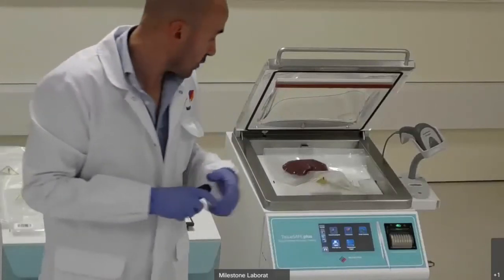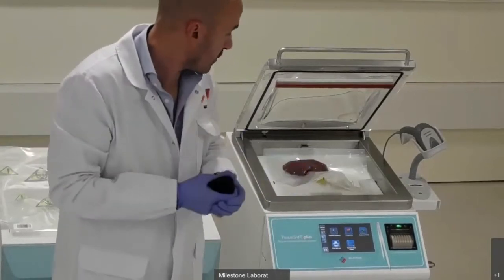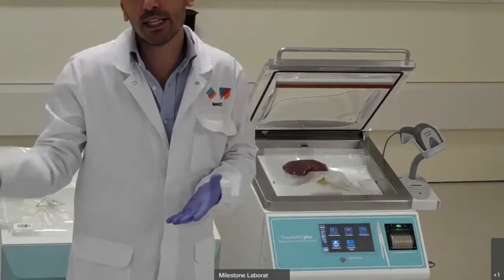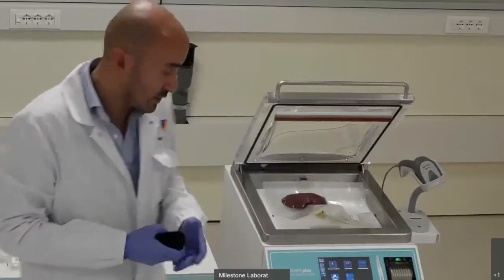But before doing that, I want to recall the fact that Marco also mentioned in this presentation that in cold conditions, this specimen can maintain optimal morphology up to 72 hours.